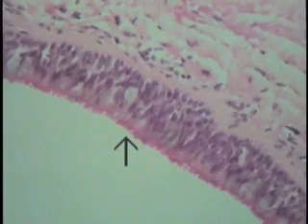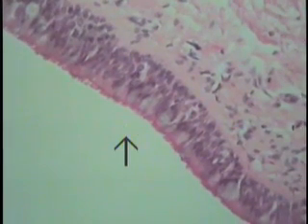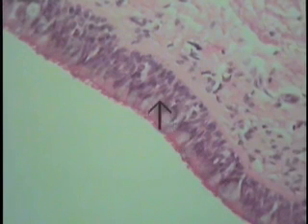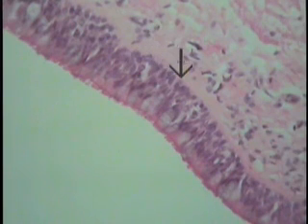This is what pseudostratified columnar epithelium looks like. This is lining the trachea. Note that even though it is a simple columnar epithelium, it's a rather confusing one. You have a layer of nuclei running here, another layer appears to be here, and another one right above the basement membrane, which in this particular section can be visualized. This sort of light salmon area here is a thickened basement membrane.